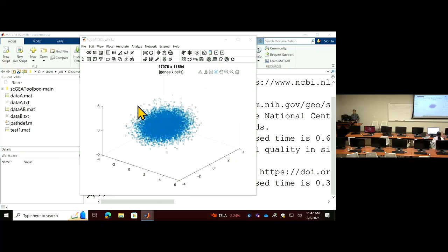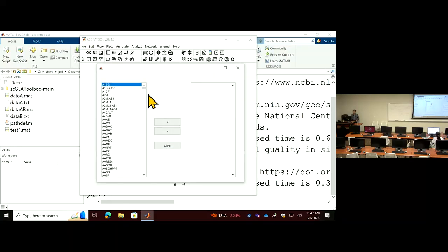Now, if you look at your list of genes, it's better, right? We removed those strange names of genes. So all these gene names are officially accepted. They have an official name.